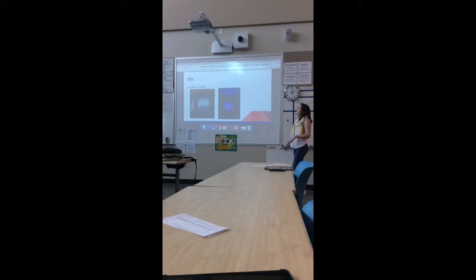So the data that our group got, our data was invalid. So these are two pictures of it. So it shows right here the ladder, which was the positive control, which means that it should have worked, which it did. And then one of ours stayed in the well, but none of them actually ran.